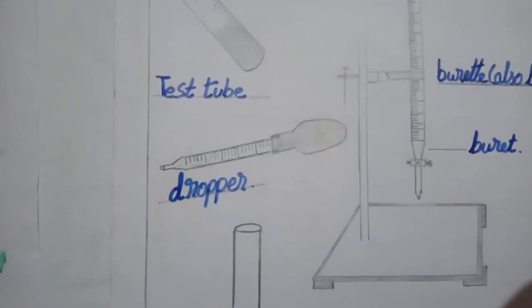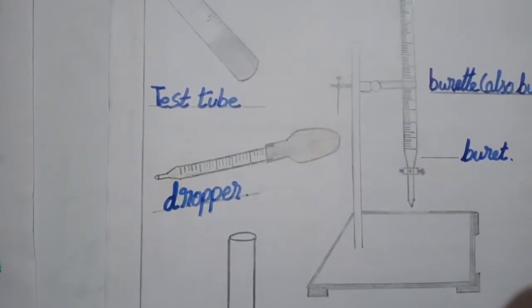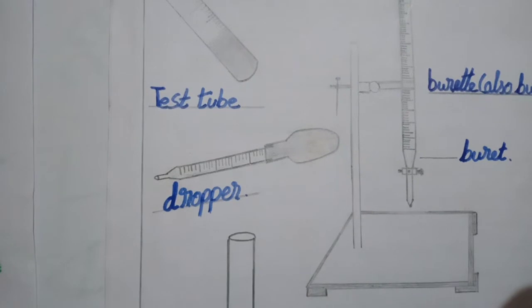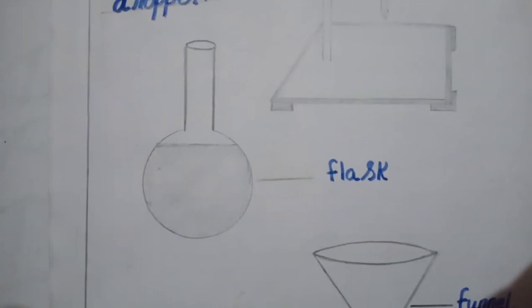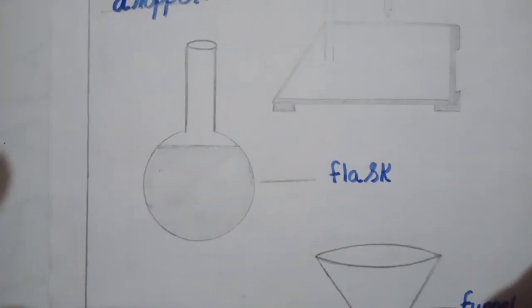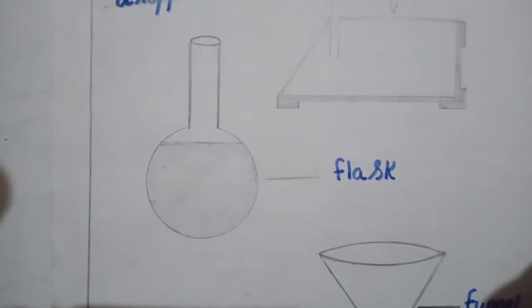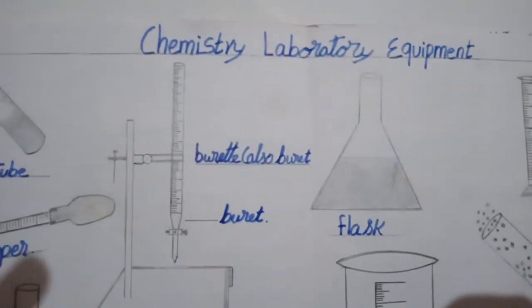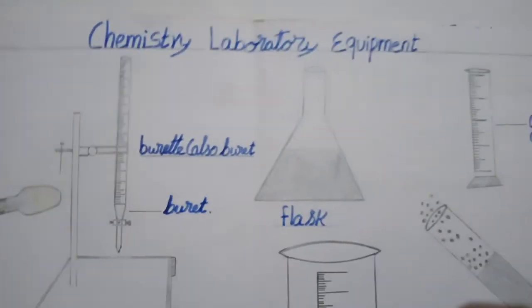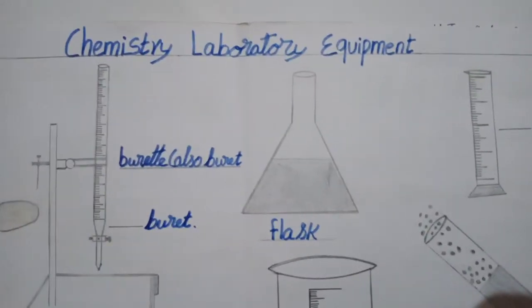Next one is a dropper. This dropper is used to put some chemical into the test tube. Next, this is a flask — this type of flask is a round bottom flask. Next one is a burner.